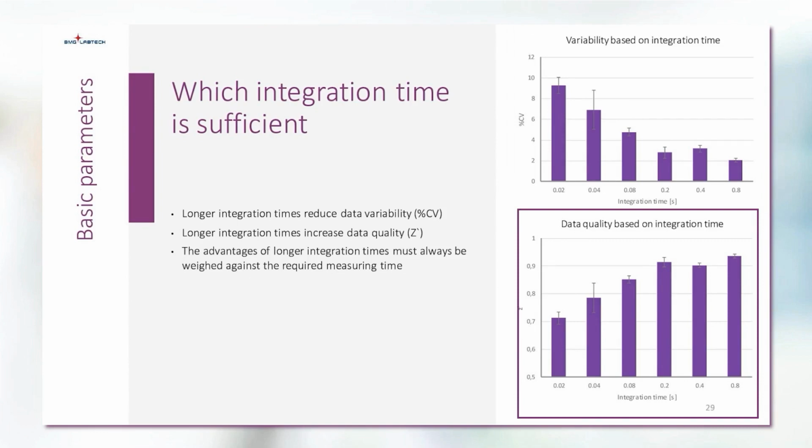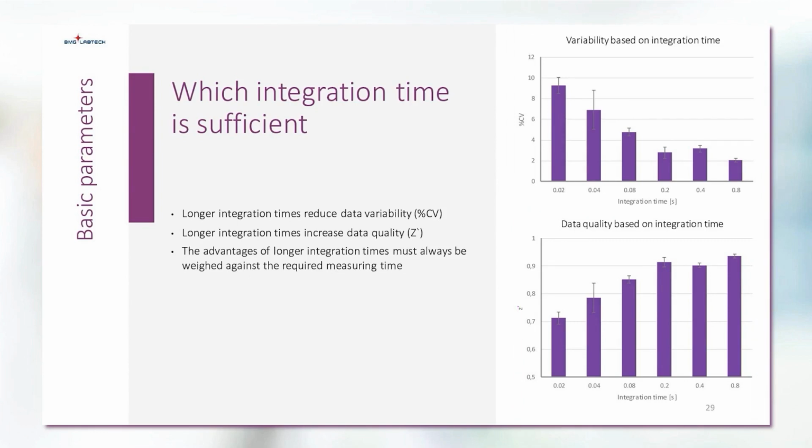However, in the end, the advantages of longer integration times must always be weighed against the required measuring time that increases accordingly.